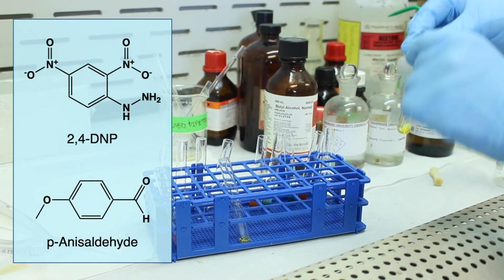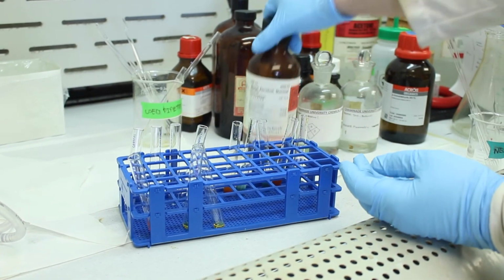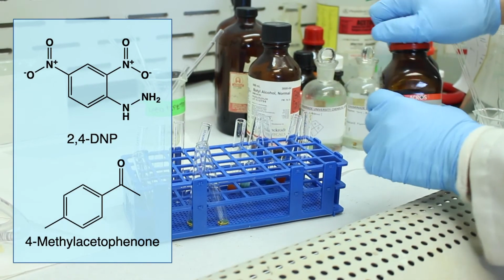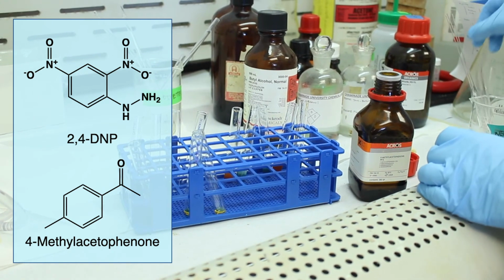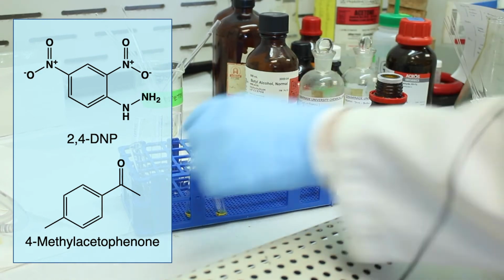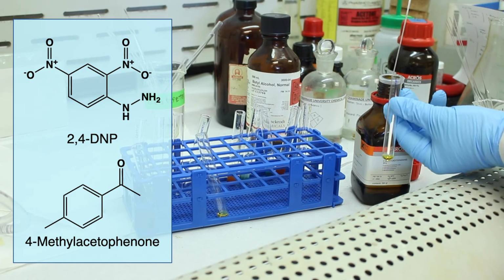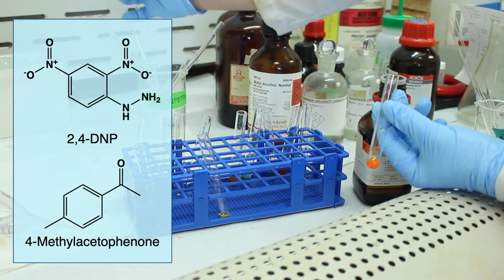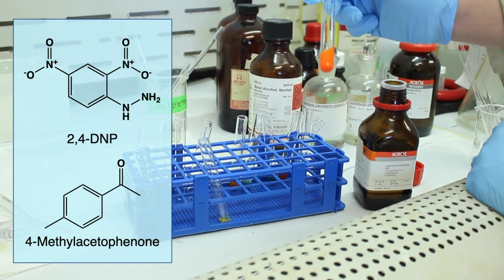Now we're going to try a ketone. So this one will be acetophenone. We've actually got 4-methyl acetophenone. So it's a benzene ring with a ketone, but there's a methyl group. The methyl group doesn't interfere with it at all. So we're just concerned with the ketone group. So we'll take our test tube. As you can see before, it looks exactly the same. We see a positive test result. So nice orange solid.